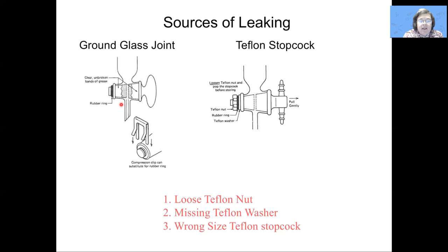For the stopcocks at the bottom of the separatory funnel, they can be made of glass, in which case grease needs to be used to both lubricate the glass joint and to prevent solvent from leaking out through these edges. With the separatory funnels that we typically use, which employ Teflon stopcocks, we have a particular assembly that, when put together properly, prevents leaking through these edges. There are three components: a Teflon nut, a washer, and a rubber O-ring. If this Teflon nut is loose, it might leak. If you're missing the Teflon washer or the O-ring, it might leak. Or if you have the incorrect size stopcock for that joint, it also might leak.